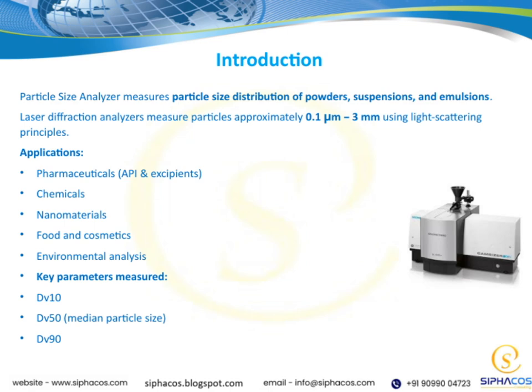Now, these measurements are extremely important across a variety of industries. For example, in pharmaceuticals, they help us understand the size of active pharmaceutical ingredients and excipients. In the chemicals and nanomaterials sectors, particle size influences reactivity and stability. Food and cosmetics companies also rely on this data to ensure product consistency and quality. And in environmental analysis, understanding particle sizes can tell us a lot about pollution and environmental health.